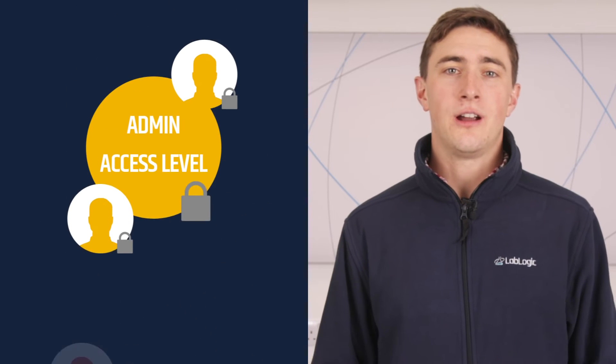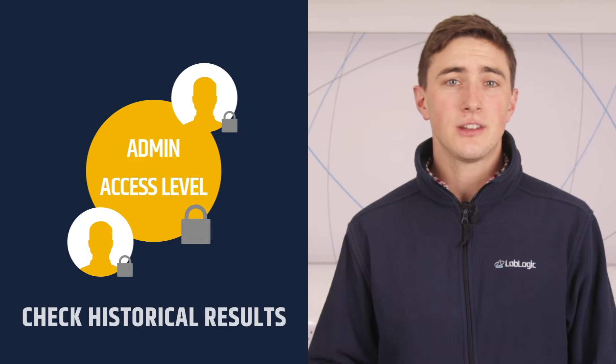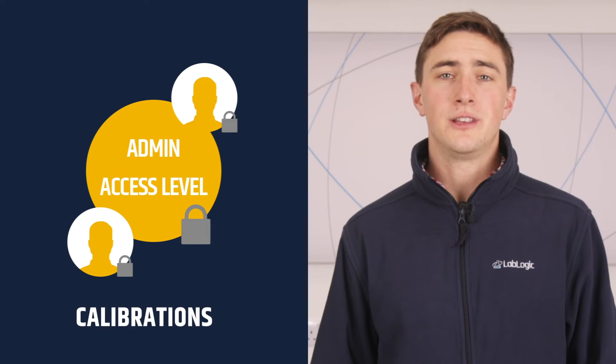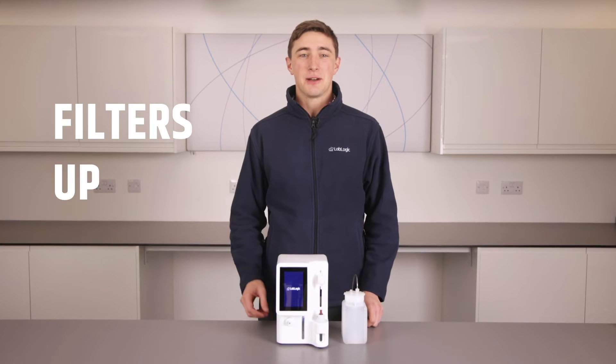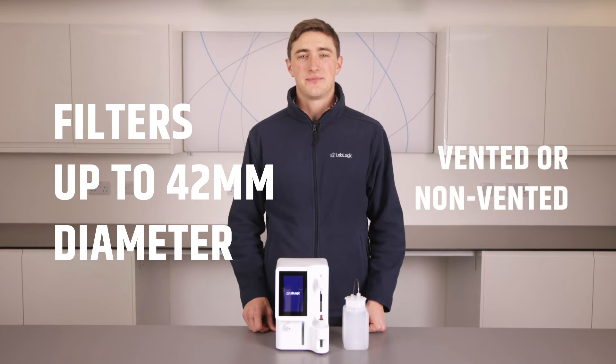The administrator access level grants them access to run the test, check the historical results, and manipulate some of the settings of the unit including editing user logins and performing yearly sensor calibrations. The unit is capable of testing filters up to 42 millimeters in diameter and they can be either vented or non-vented. No plugs required.